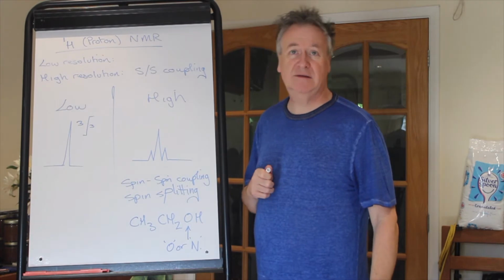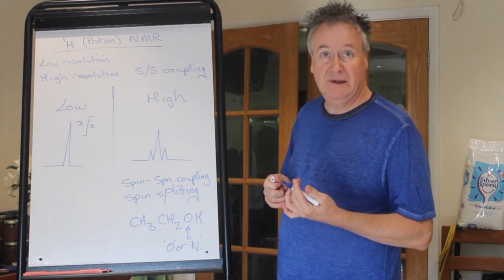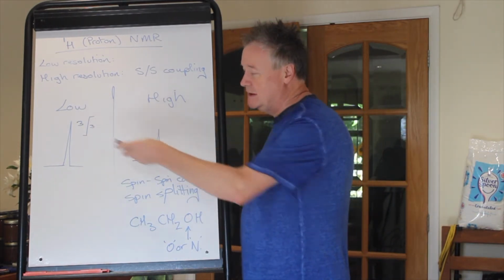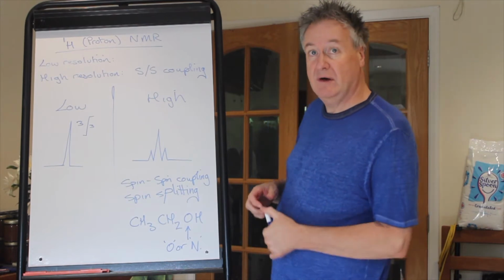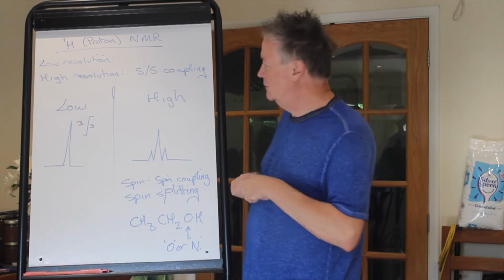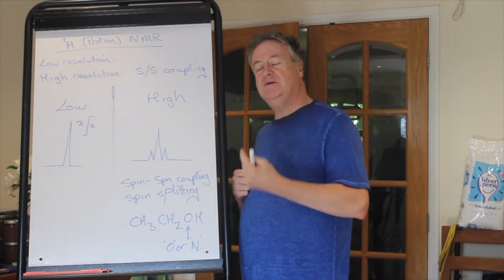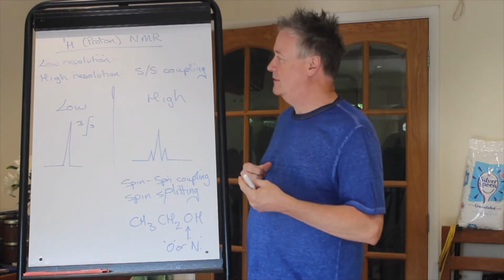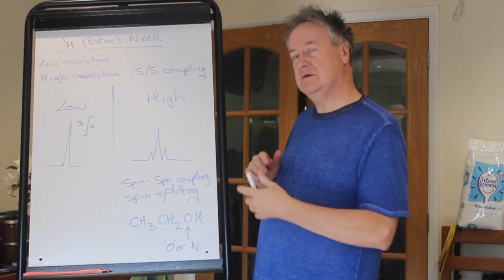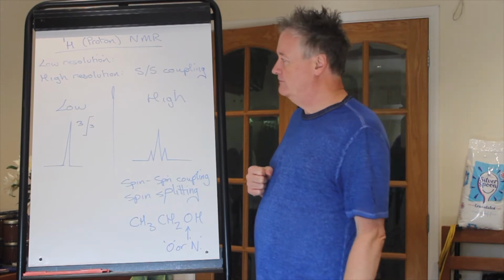This very much depends on what the print of the NMR spectrum looks like. But that would represent 3 hydrogens in height, or at least a height of 3 compared to something that has a height of 1. Now, with low resolution, all the NMR spectra would look just like carbon-13 NMR, except that obviously, like I said before, the shift values will only go as far as 12. Not really what you see very often.